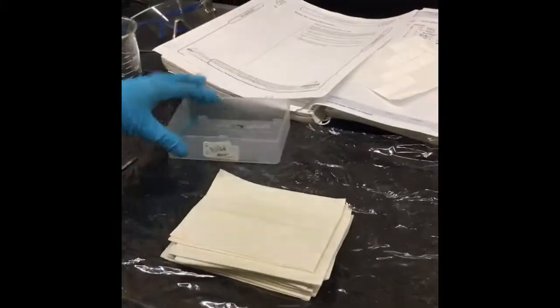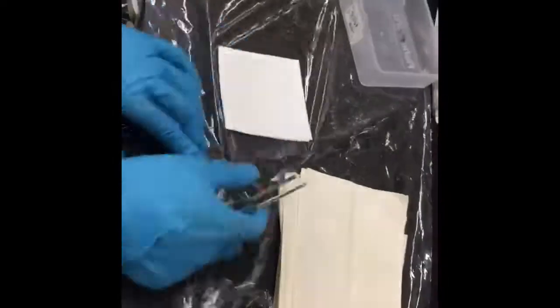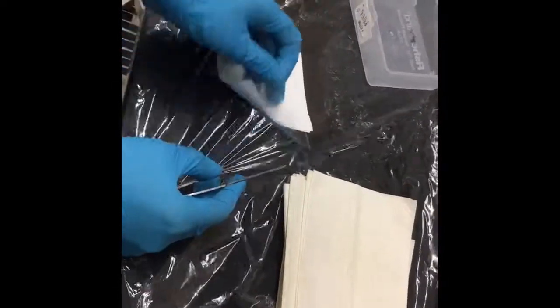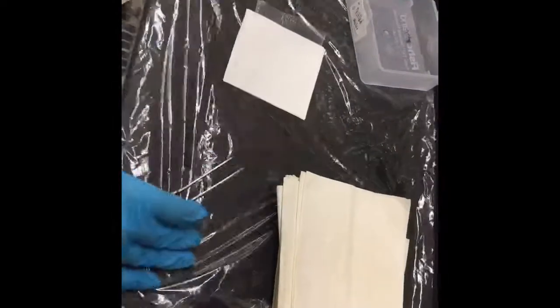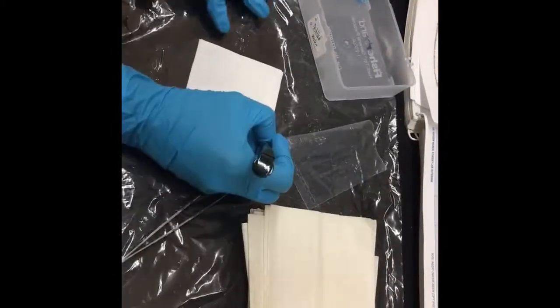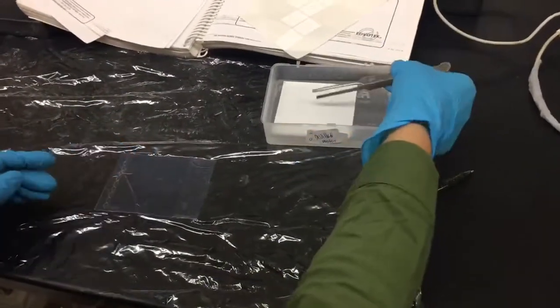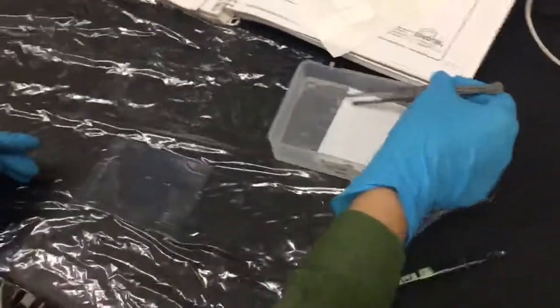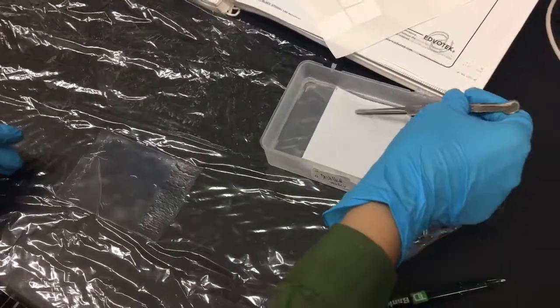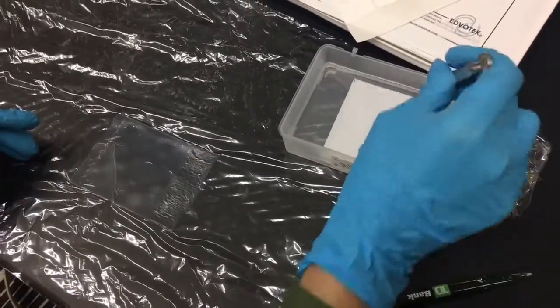To detect the DNA, we flip the gel and membrane filter onto the filter side. Then we remove the gel and allow the membrane to dry. We use forceps to avoid touching the center of the membrane. Then we place the dry membrane in a clean tray with 100 milliliters of dilute Blue Blot solution for 10 to 15 minutes.